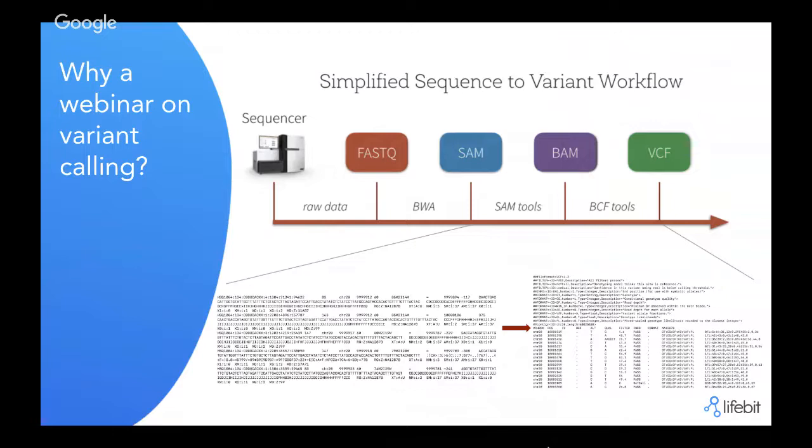Then with those BAM files, with those reads aligned, you can already start calling all these variants. Also, instead of working from the FASTQ every single time, once you get to the BAM files, the alignment part, you will typically keep those alignments, and afterwards you can keep using them to refine or rerun variant calling methods instead of starting from scratch.